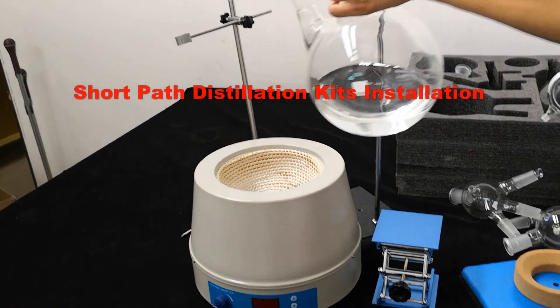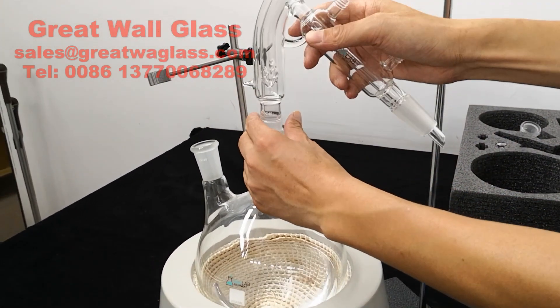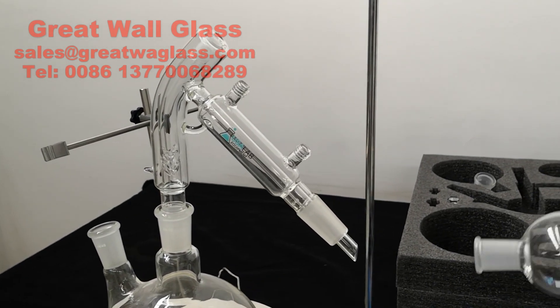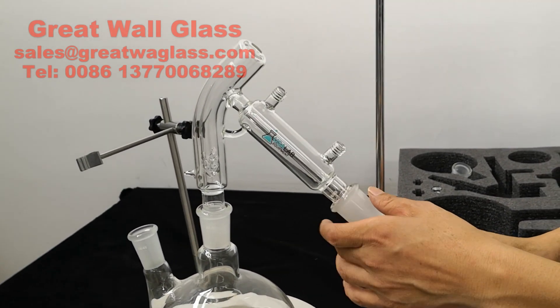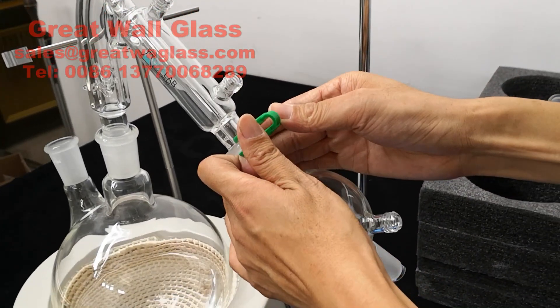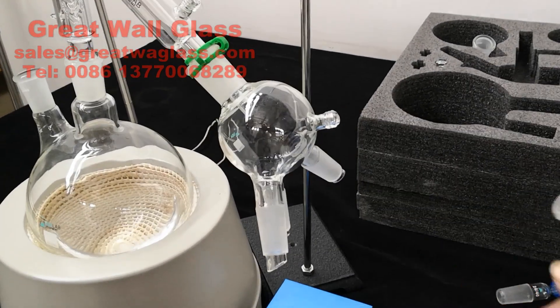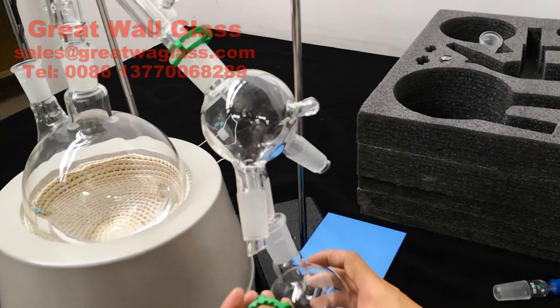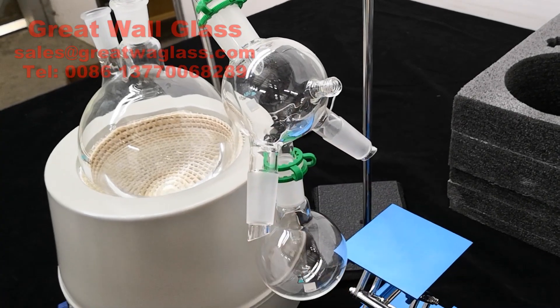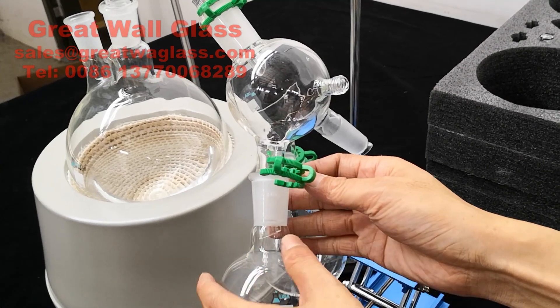We are going to show you how to put these parts together. First, you put the flask on and you put the head on. Now it's the cow receiving flask — you put the plastic clamps on and the 250 milliliter RB flask on again with the plastic clamp. Same procedure for the other two.